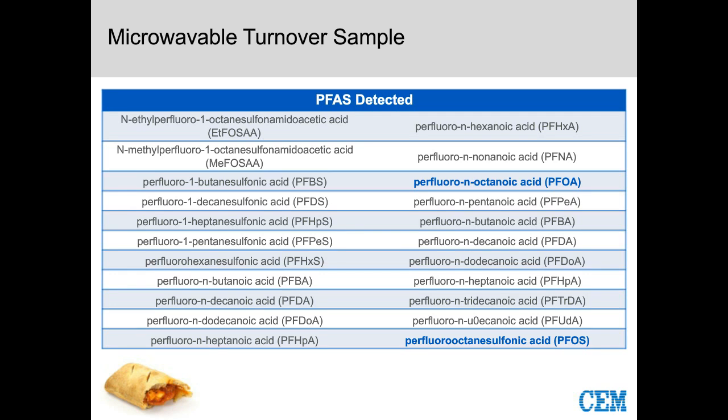As I prepared for this talk, I stopped using my Teflon-coated pans. I've really thought about some of the food stuff. I guess I was just kind of naive to how many different components are out there that really are exposing us to these compounds. In this case, we pick up both PFOS and PFOA, so those two that we're paying particular attention to.